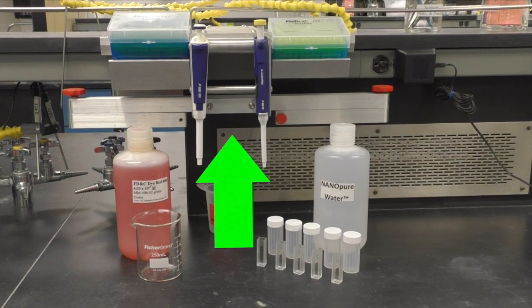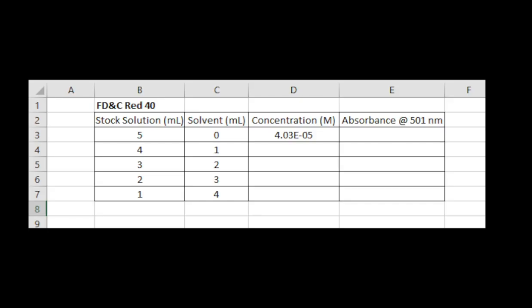You'll also need micropipettes and tips. To start, make a table in Excel listing the milliliters of stock solution, milliliters of solvent, concentration, and a column for absorbance for each dilution. You should make 3 to 5 different dilutions for the most accurate results.